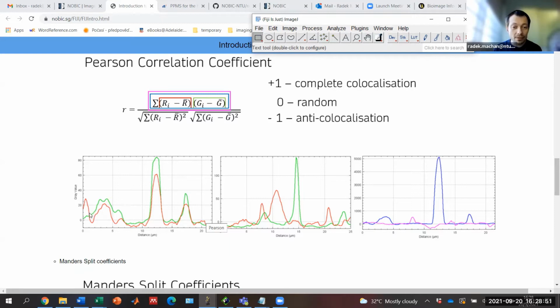What I did at first is subtract the mean value from the image, so that you can see here that now I have values which are negative as well as positive. Negative means those are pixel values which are lower than the average pixel value. From each pixel I have subtracted the mean intensity, and I do that for both channels. So these are the mean subtracted line profiles.